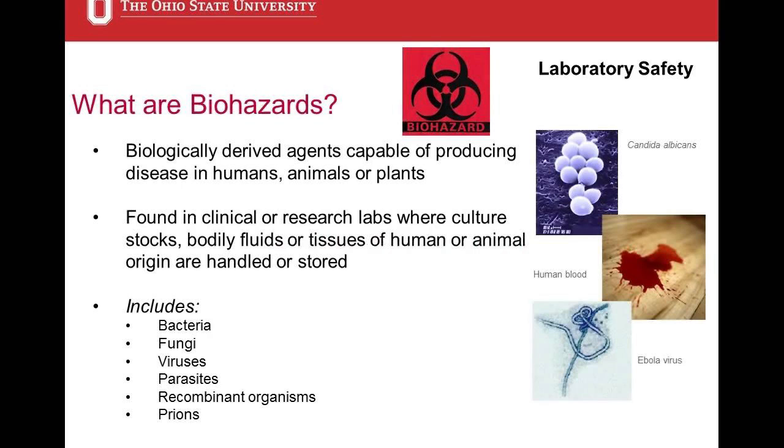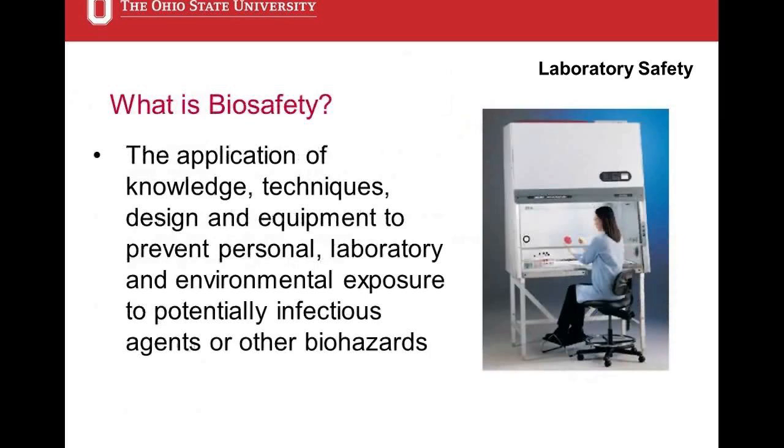So we talk about biohazards and then we talk about biosafety. These are not the same thing, okay? Biosafety is the application of knowledge, techniques, design, and equipment to prevent personal, laboratory, and environmental exposure to potentially infectious agents or other biohazards. So biosafety is kind of the science of working with biohazards.